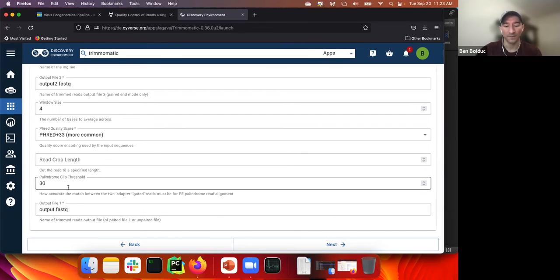So if you put in a forward and reverse pair of reads, you're going to get the forward reads that survive with a pair, the reverse reads that survive that also have a pair, that's 2. You're going to have the reverse reads that don't have a pair anymore, so its mate perished, didn't survive, and then you're going to have it for the forward reads as well.